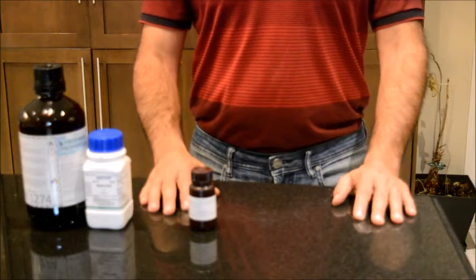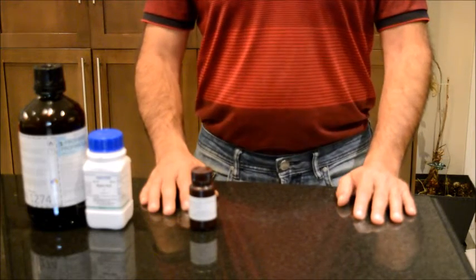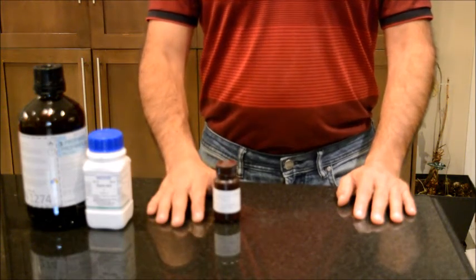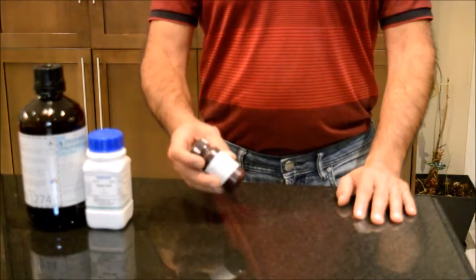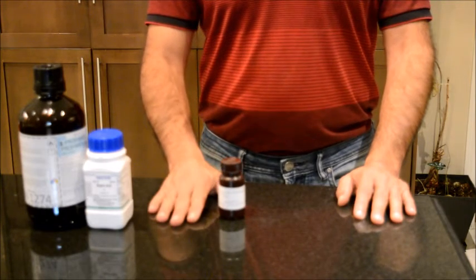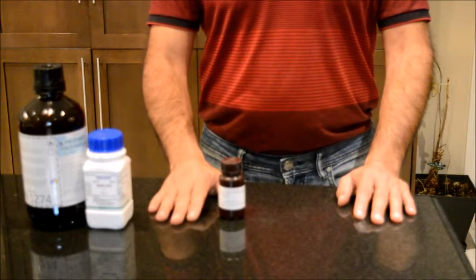and quantitative analysis of pharmaceutical excipient. Today I'm going to talk about magnesium stearate. And this video is a request by one of the viewers that asked me to prepare a slideshow about how to do the quantitation of magnesium stearate in solid dosage form.